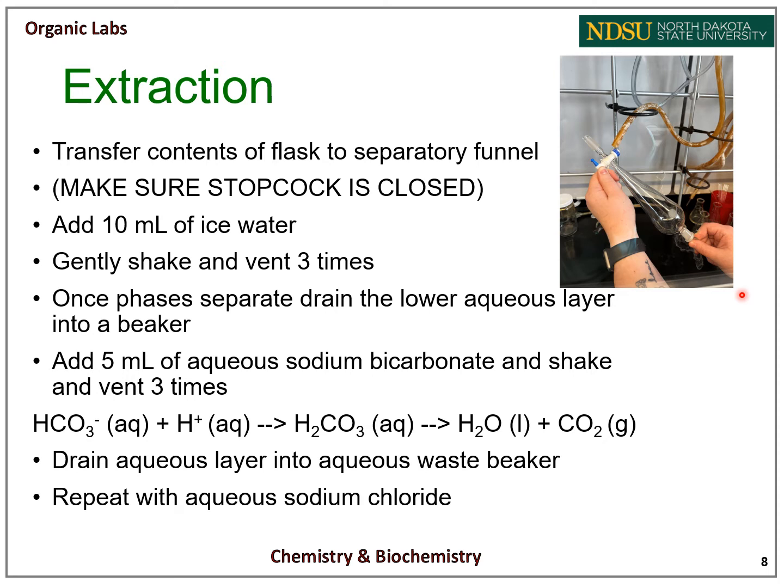When you're doing this, make sure you're doing it into a fume hood away from everyone else. The pressure that has built up can cause solutions to come out quickly. You will do this 3 times. Place the separatory funnel into the ring stand and allow the phases to separate. Your aqueous layer will be on the bottom, so drain that into a beaker.